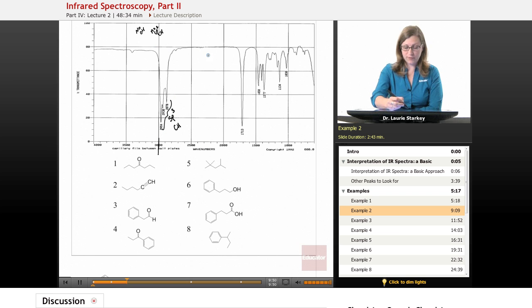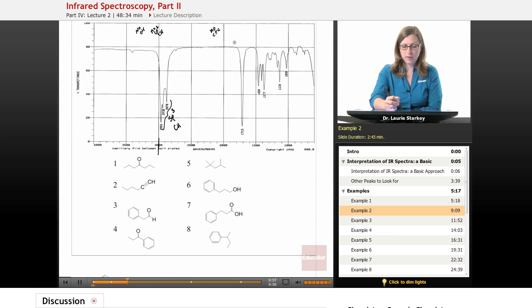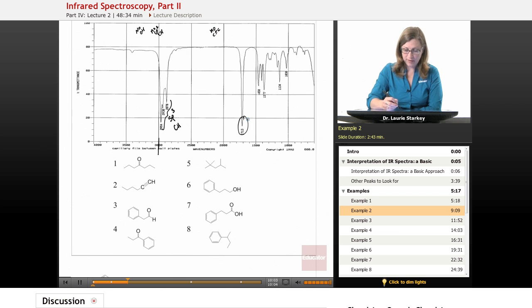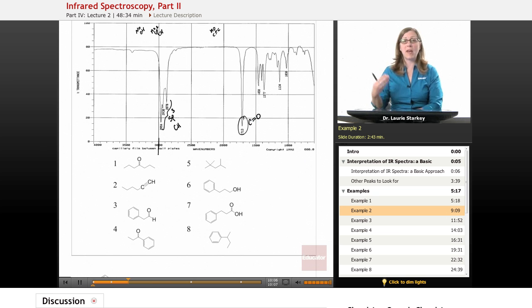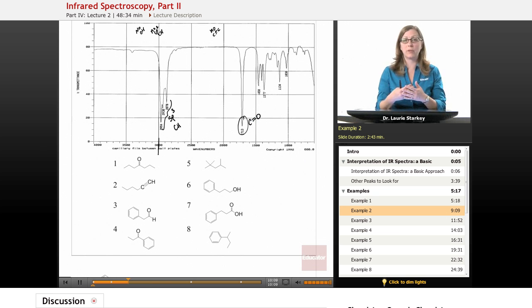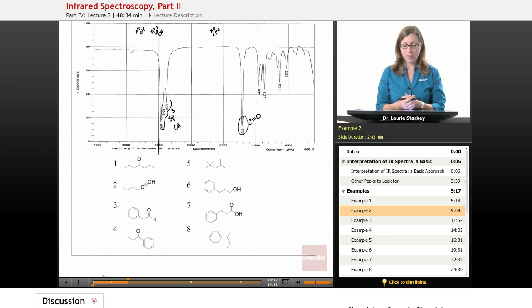We continue reading left to right at 2200 — no triple bonds. Then we move down to 1700. What do we find? We do have a carbonyl. A systematic approach means we're going to be looking for our obvious peaks and we're not going to be missing them any time they show up.